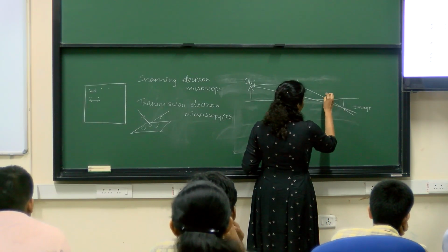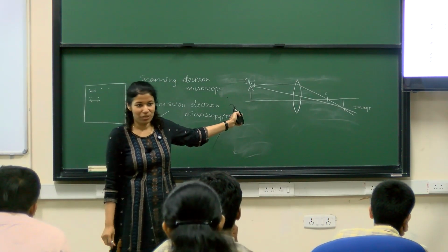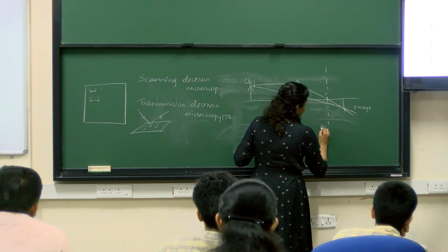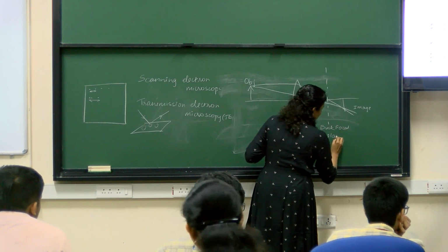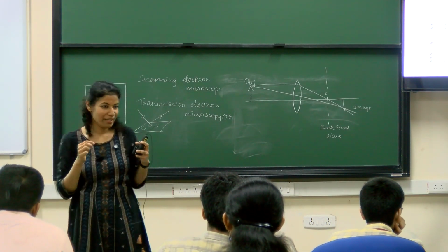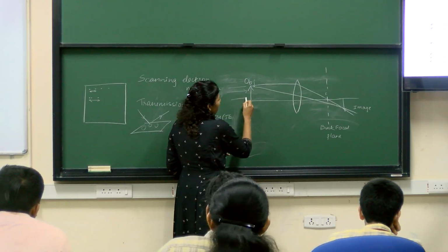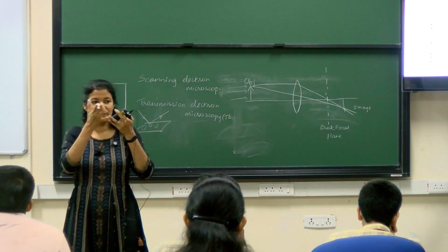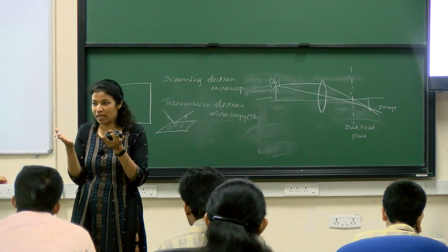This point we'll call the focus. What you were asking, how do you get a magnification? At this stage, we call this the back focal plane. Have you all thought about why we get this magnification? What happens is there is interaction of the light with your object, okay? And light is composed of different waves, so they will all interact with the object in a different way.